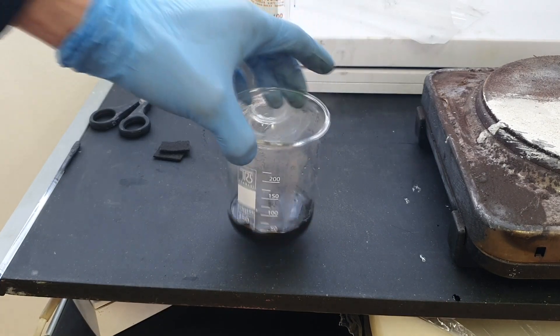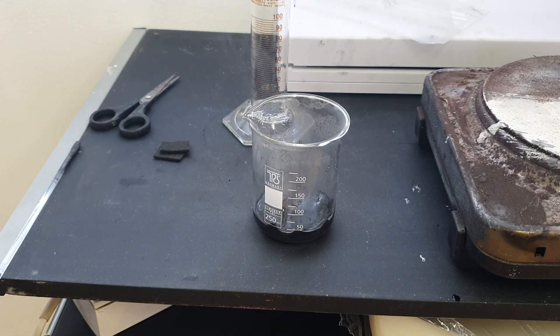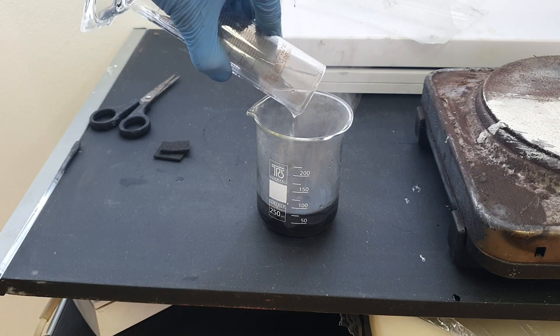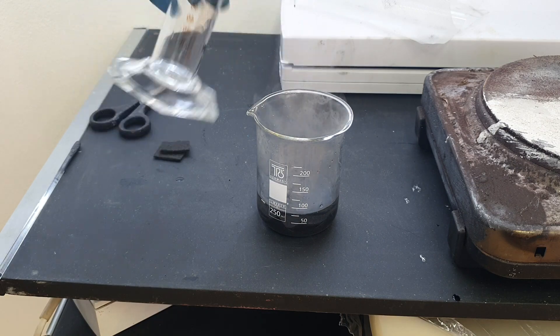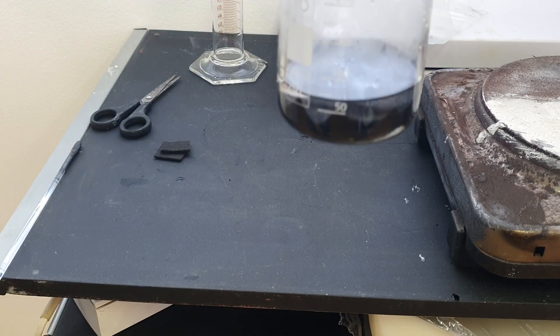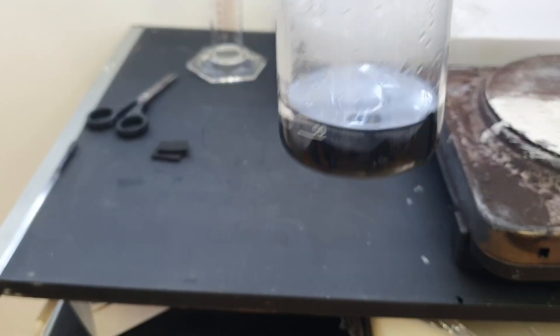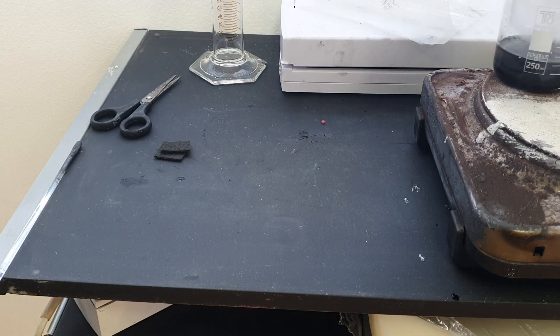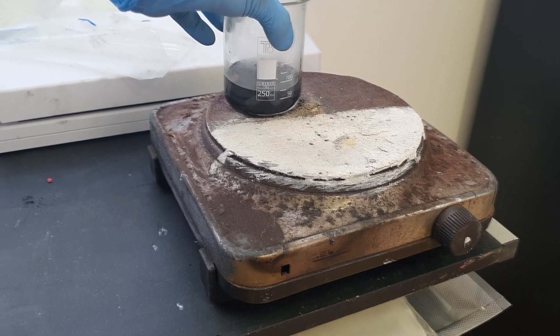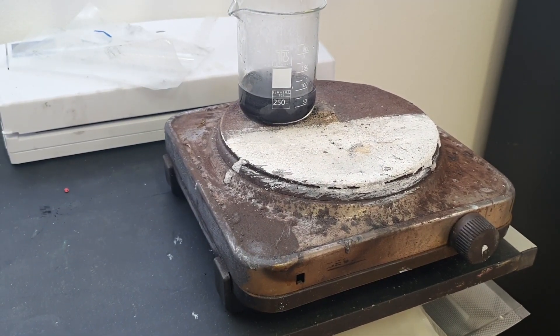So actually I will add 30 ml of sulfuric acid and 10 ml of nitric acid. Okay great, and now I will leave it on the hot plate for 1 hour at 60 degrees C.